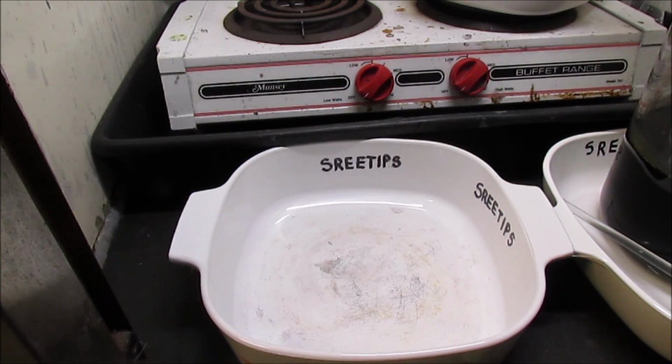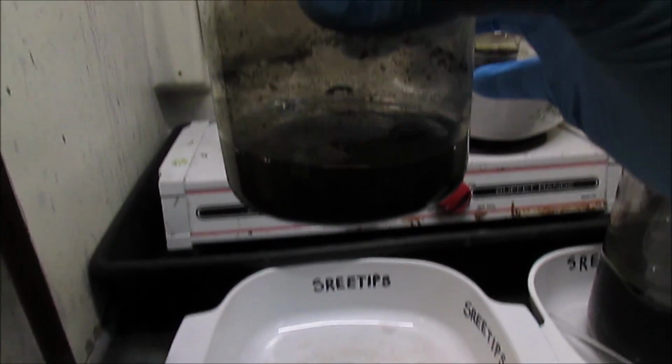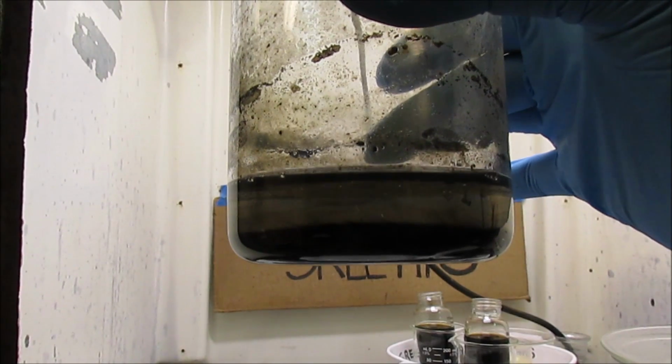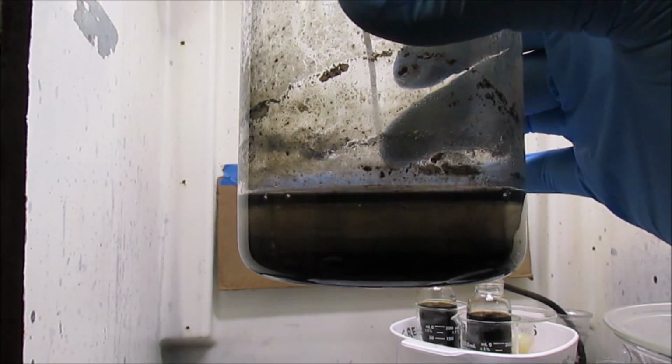And so now what I want to do, instead of going through and doing that with the whole solution, I'm just going to let this settle. But I would like to go back to this solution here. It had the zinc in it. I'm going to decant that liquid and see if we can get the black powders cleaned up in the bottom of this beaker.